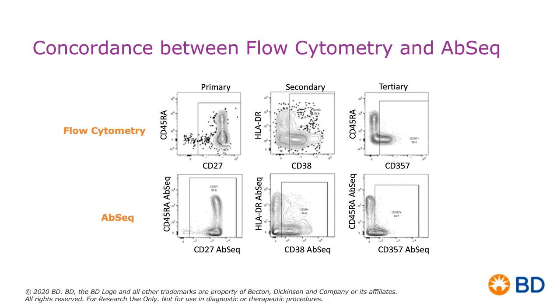Now, you could say, well, Aaron, look at that plot. It looks like it's spread around in a circle, and it looks like it's going below 0. That's basically to build the density plot, to visualize it. They kind of have to build up the layers. Think of a topography map, looking at the density and number of cells there. We have to have some layers in there. But if we remove that, all of these events are essentially at 0.